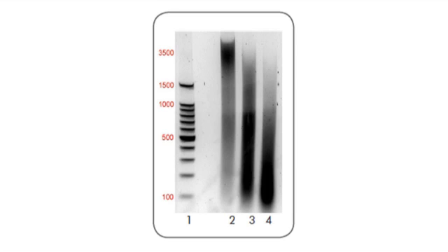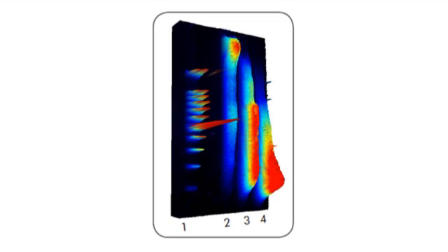Here is an example of DNA that has been under-sheared in lane 2, perfectly sheared in lane 3, and over-sheared in lane 4. And here is a spectral image of the same gel. Note the even distribution of fragment sizes in lane 3. You can now proceed to the immunoprecipitation phase.